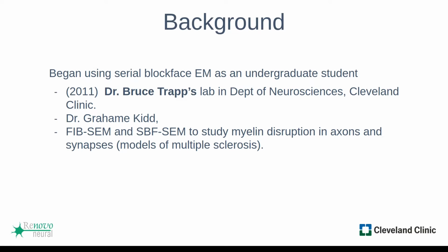I joined Bruce Trapp's lab in the beginning of 2011 when they had recently purchased a system for their lab, and I worked with Dr. Graham Kidd in getting that off the ground and developing applications and analyses to study myelin disruption on axons, axonal mitochondria, and smooth endoplasmic reticulum disruption in axons. And we looked at dendrites and their synapses and associated astrocytes.